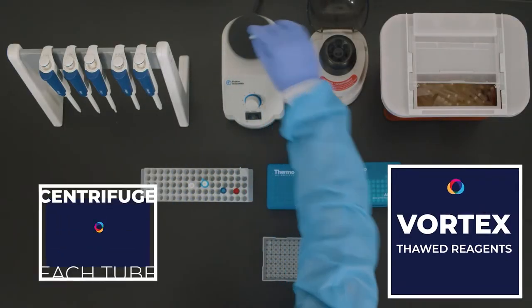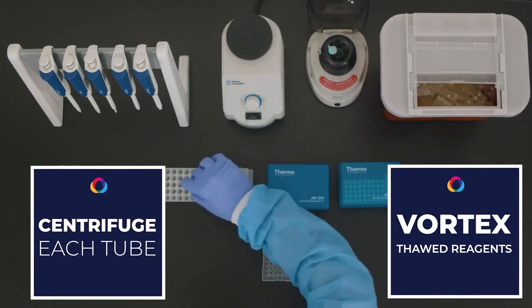Vortex the thawed reagents and briefly centrifuge each tube to ensure that all liquid is pulled down to the bottom.